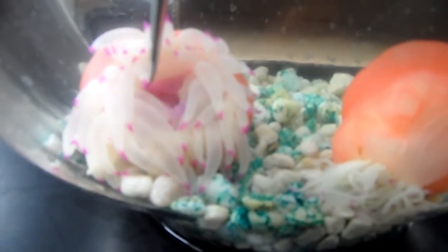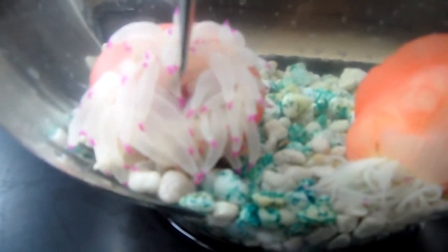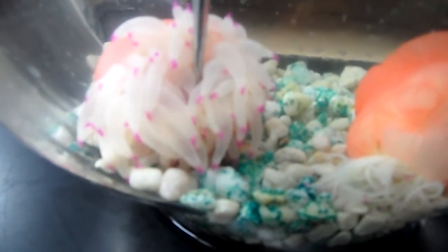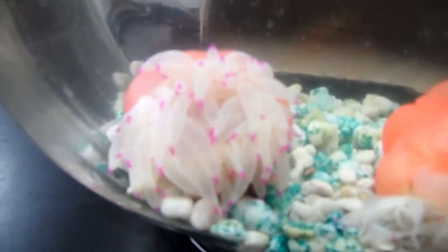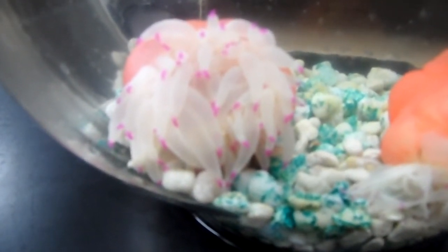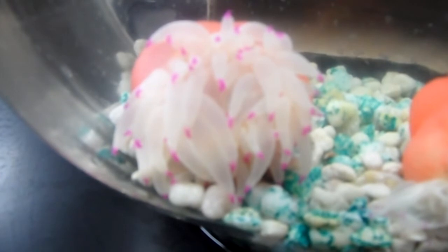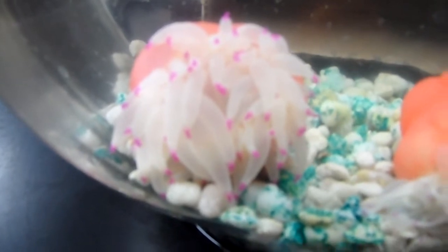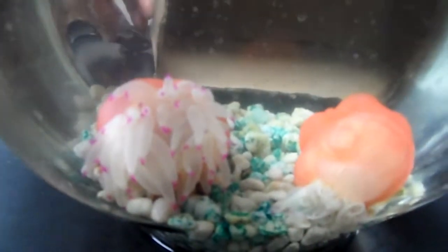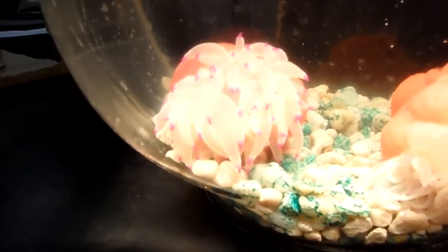Let's see if I touch it near the mouth, which is right in the center there. Well, I've roughed them up pretty good. We're not seeing a whole lot of reaction, which is surprising to me. I don't know what your hypothesis was about whether or not they can sense touch, but I thought they could, and that we would see a reaction.